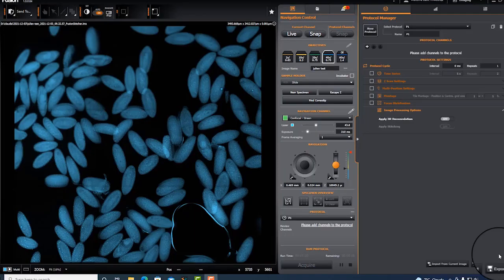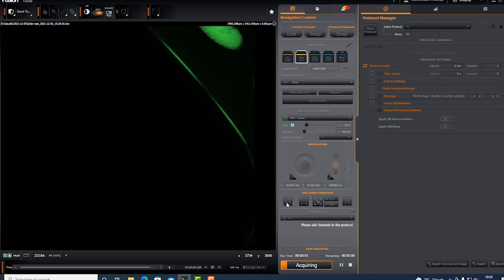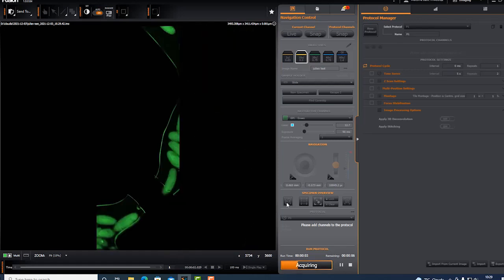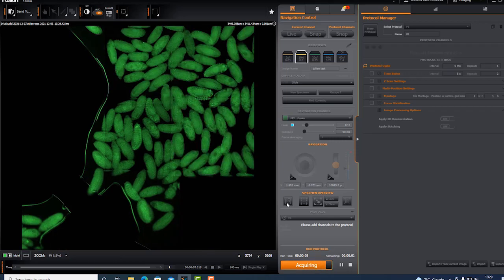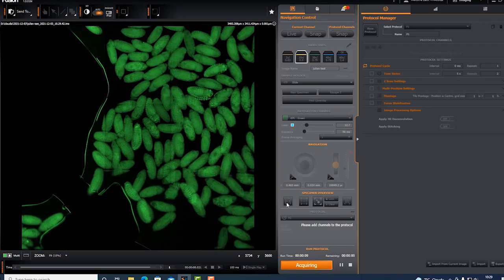In this video, I'm going to show how to combine a Z-scan with multiple positions, how to acquire different Z-scans at multiple positions, and where I set the scan around the center of a defined position. I like to start by acquiring a 3x3 overview in order to select the positions I want to use for acquisition. You don't need to do that, but I found it quite useful.